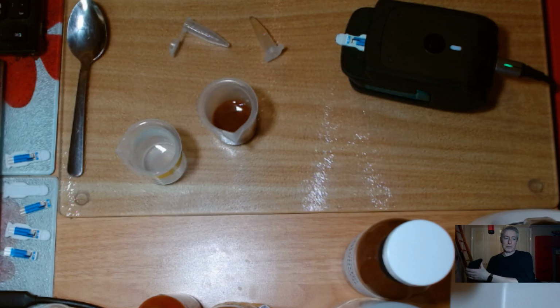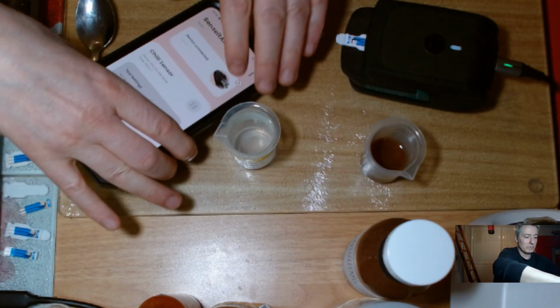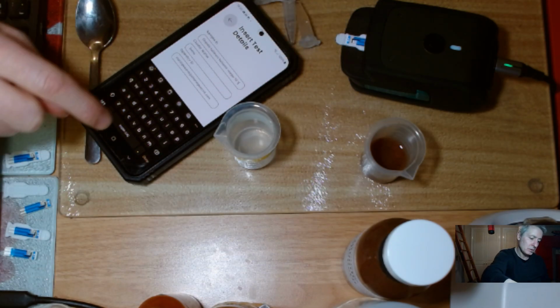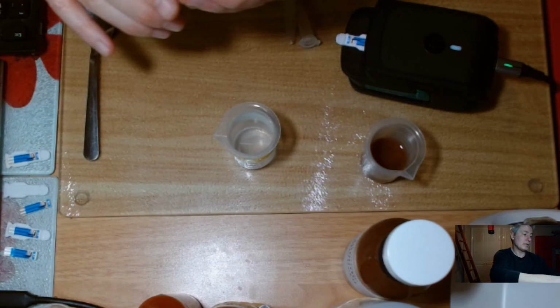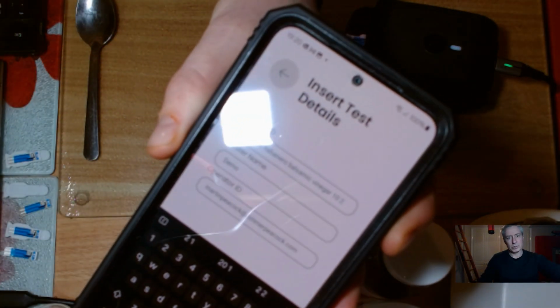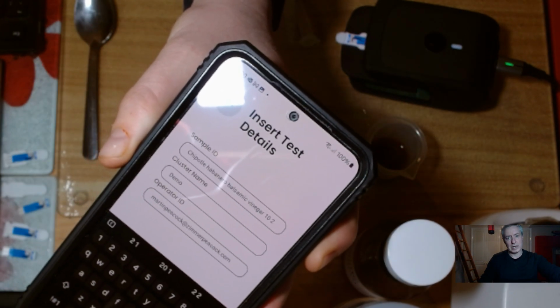Now what I'm going to do is grab my phone, because I've got an app on my phone. The app is in Bluetooth connection with the Food Sense Generation 4. I'm just going to give this a name. I'm trying to remember how to do it. Yeah, right, I will show you what I've written. So I've written something like Chipotle Habanero Balsamic Vinegar 10-2. That will allow me to identify that sample later on.